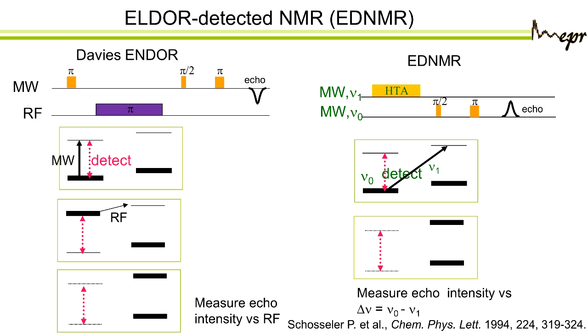We initially have a selective pulse on one transition. Yeah, we invert the population. Then with the RF pulse, we move it to the other manifold, and then there's no population difference, and here comes our signal. So what do we do? We do microwave, RF, yeah?